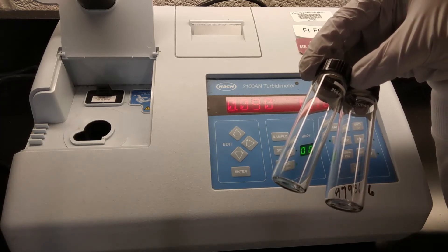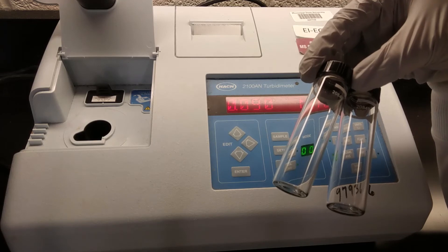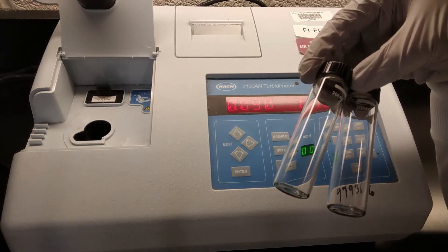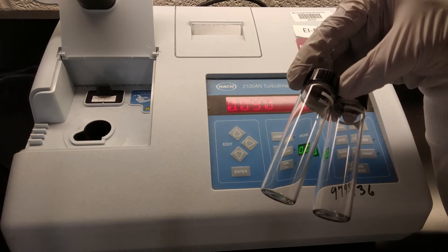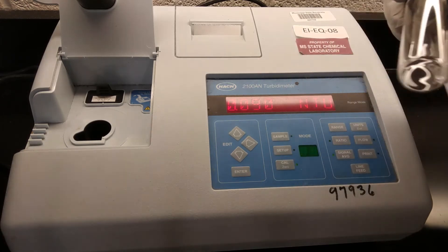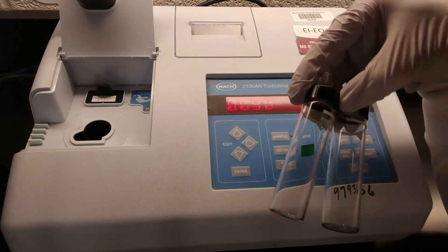And so with these two cells, we're going to have one for our blank, which is just going to be our laboratory deionized water, and then the other one is going to be our sample. I've chosen just a random old sample. I think it was maybe runoff water. So you'll be able to see with the naked eye that it is a little bit cloudier, a little bit more turbid than our deionized water. But this instrument is going to be able to quantify that.